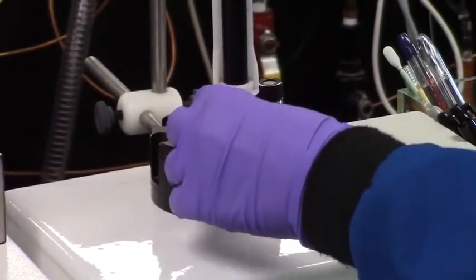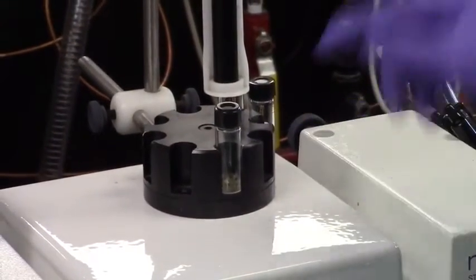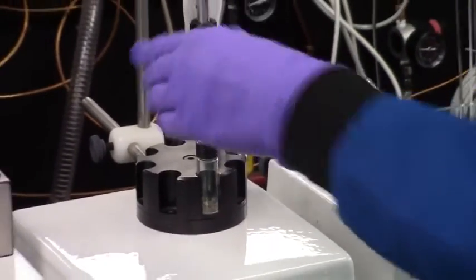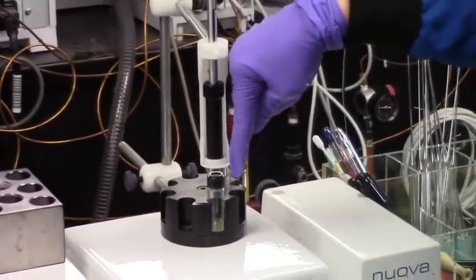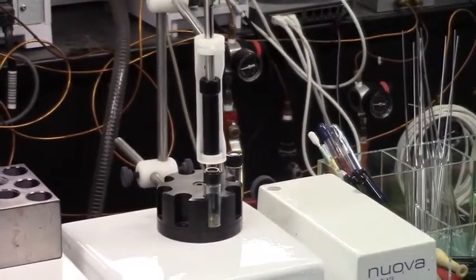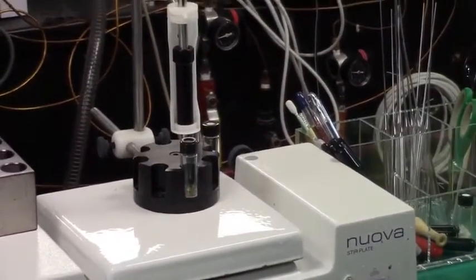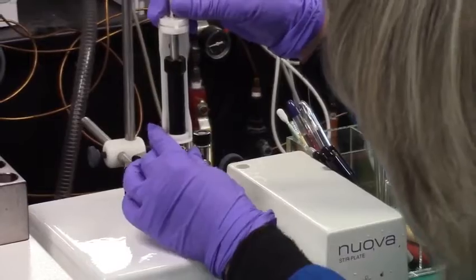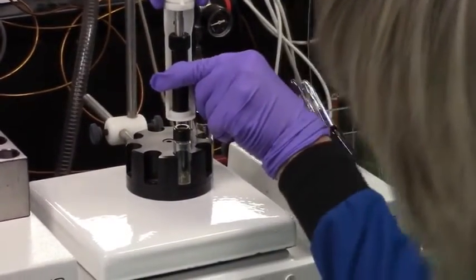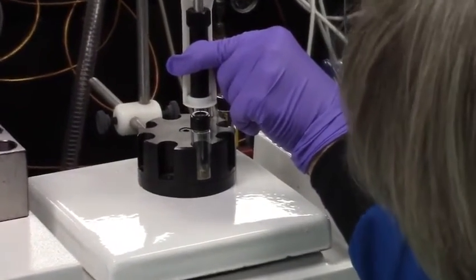And then at this point, it's directly over the hole in the top of the vial. So I'm going to twist on the silver part on the top, and what that's going to do is cause that needle to come down, and it's going to go right through the septum. It's going to puncture the septum, and you'll hear a popping sound when that happens. You might not hear that with all the lab noise, but if you were up close to it, you would. So at this point, the needle's coming down, and it just went through the top of the septum.